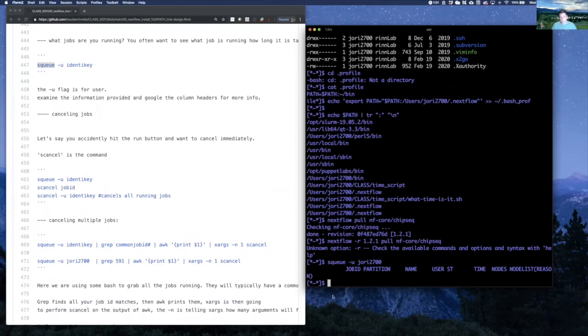But sometimes you might see here in this job ID that you have like 20 jobs running, and you don't want to go do that each one by one, where you say scancel and job ID is the way to cancel a job. So you can see what's running, look for the job number and cancel with that. That can be quite a problem if you have a bunch of jobs running. But if you want to cancel them all just blanketly, you can use scancel -u and then your username, and that'll just cancel everything that's running.